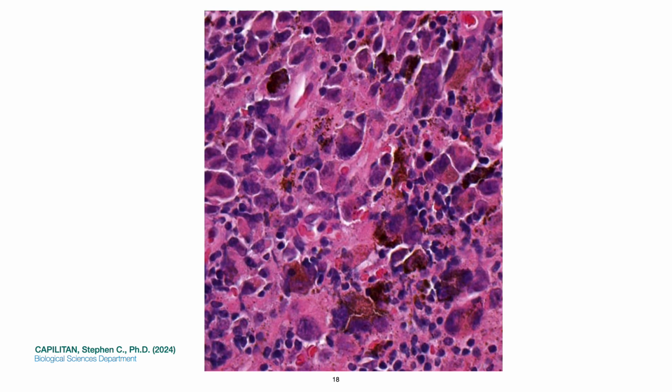Melanoma in high power: these are malignant tumors of melanocytes, most often arising in sun-exposed skin, though examples arising in sites not traditionally associated with sun exposure do occur, such as the bowel and dura.